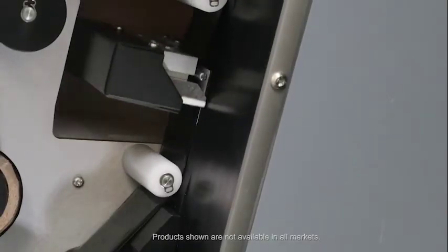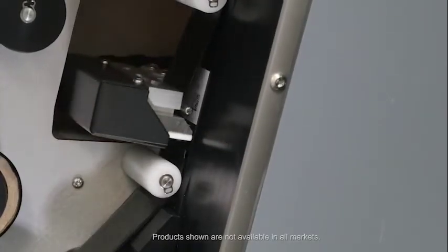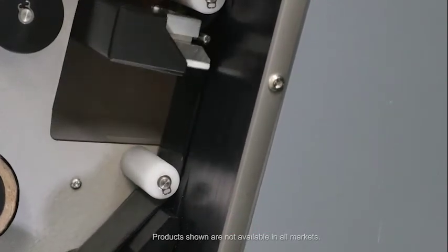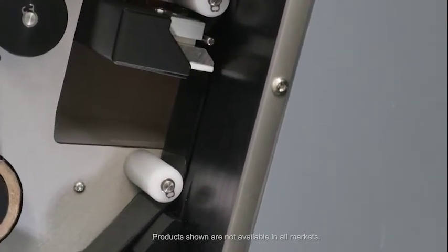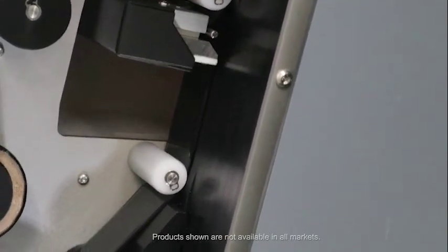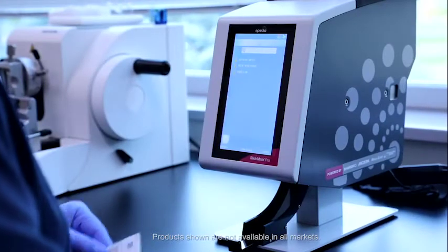The system's vertical print orientation uses gravity to feed slides, reducing the number of moving parts and the stress of the instrument.